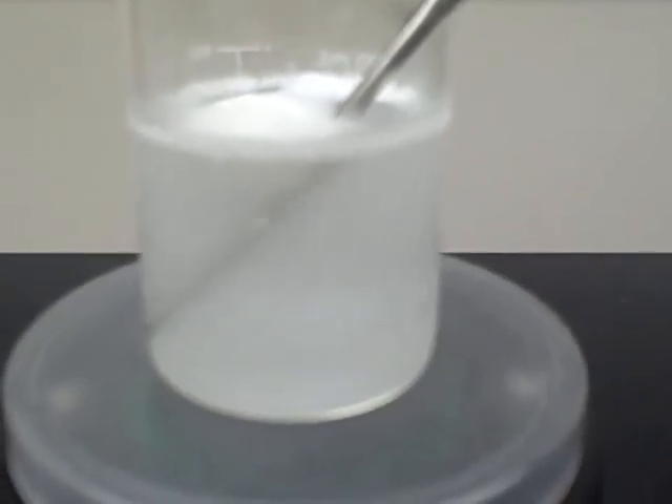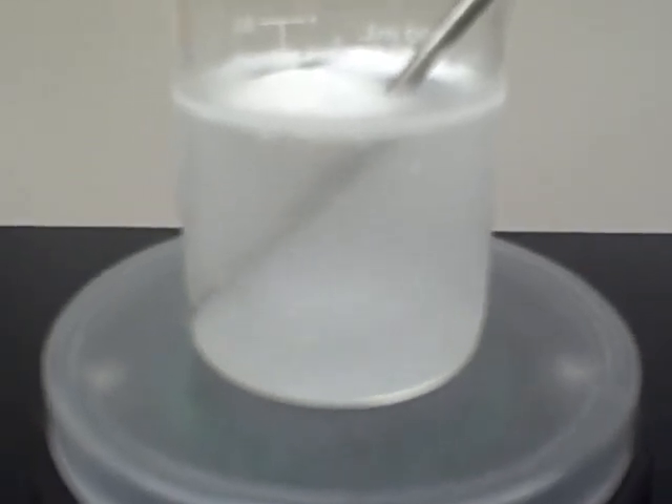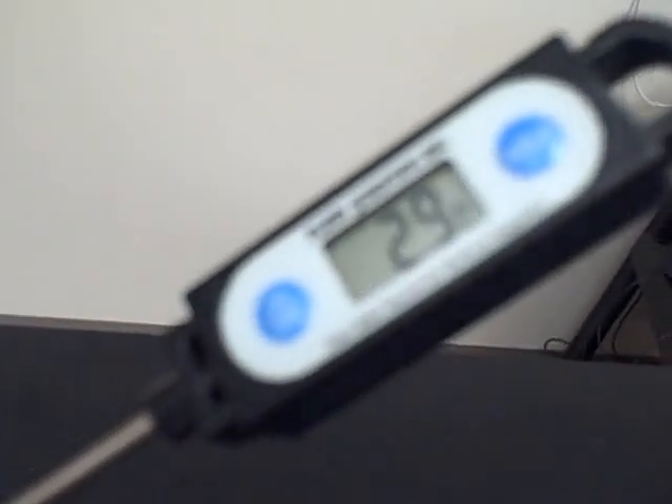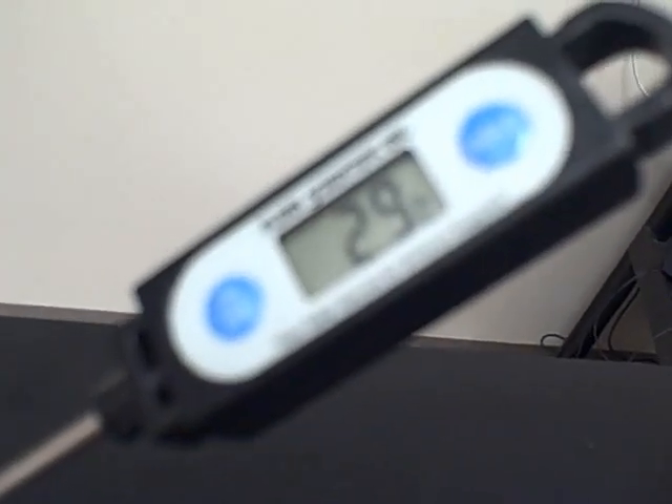Most of that ammonium nitrate is now dissolved. The solution begins to clear a little bit. You can see that our temperature is going down almost 22 degrees.